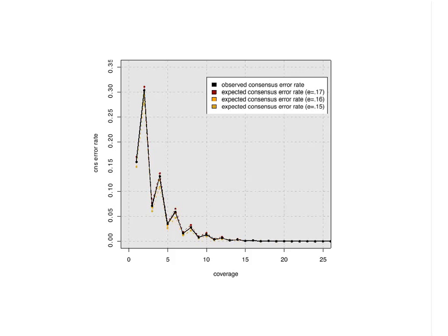However, in the assemblies I've looked at, none of the Illumina data can assemble through the larger repeats, and when I say larger, they're in the 2K, 3K, 3,000 base range, whereas all the PacBio assemblies can get through these. So it's really a complementary technology, and it's a question of what you're after. If you're after just the gene sequence, and don't care too much about the full structure and the repeats, the Illumina data at high coverage is your best option. If you're interested in the repeats, you can add some PacBio sequencing to that to get through the repeats and combine it with the Illumina data to get the best of both worlds.